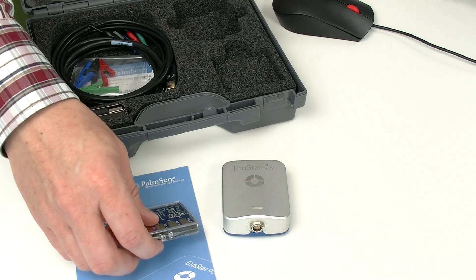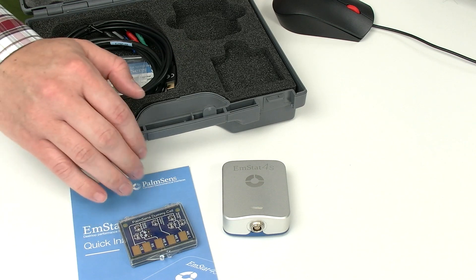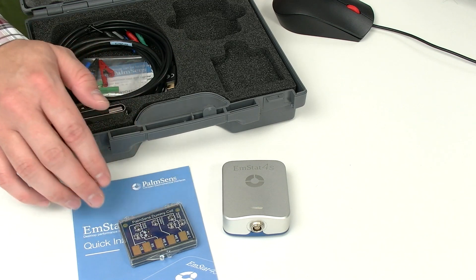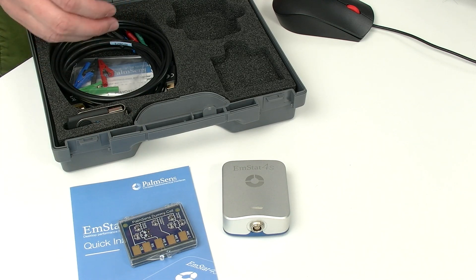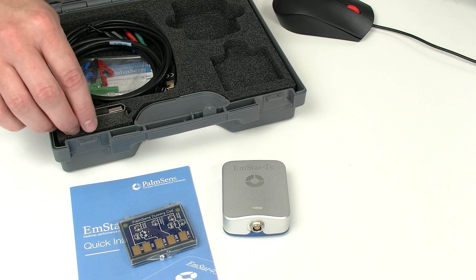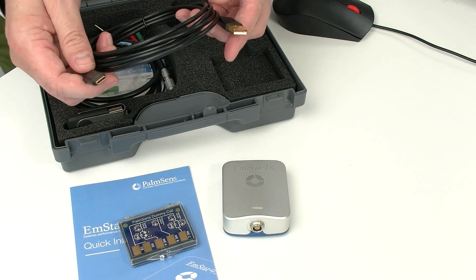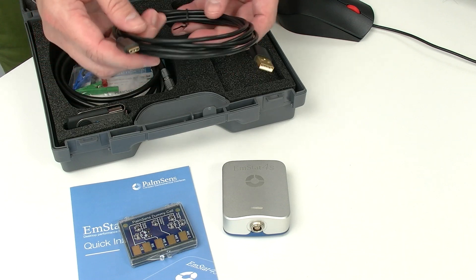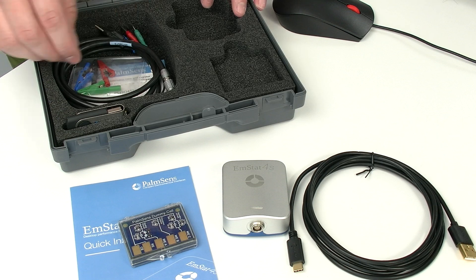You will also find in there the Palmsense dummy cell, which has a few test circuits — three different ones. That's very handy if you want to make measurements where you know exactly what to expect. We also have a USB-C cable in the box to connect the potentiostat to the computer and to power it.